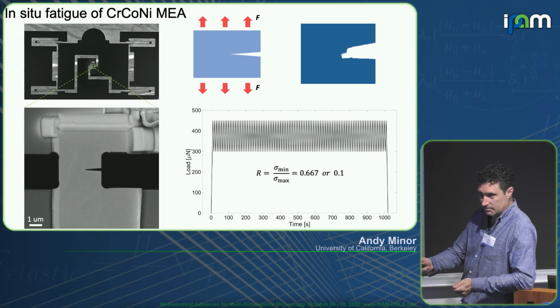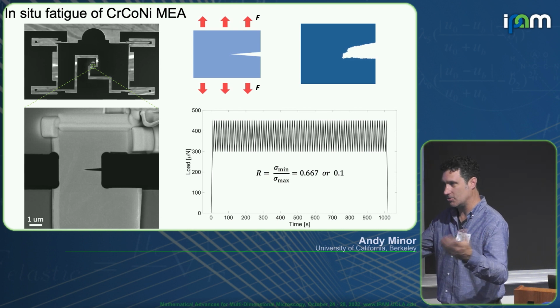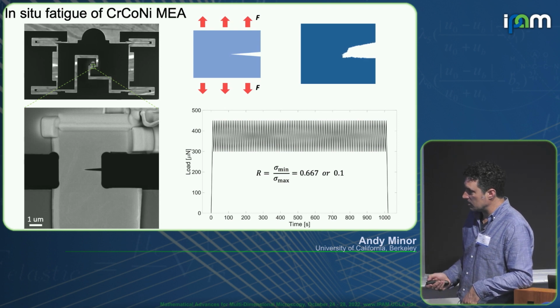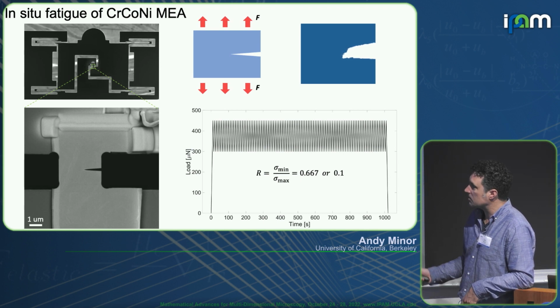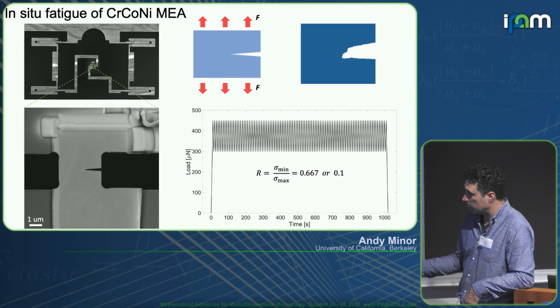tensile tests, if you just take a sample and pull it apart, are kind of chaotic, and you don't really see a lot. Things just break, especially when you get down to these thin dimensions. But fatigue is good because you basically have a stable deformation that you can control. And so the way we do these experiments is to use what's called a push-to-pull tester. So this is a little MEMS type device, or a little microfabricated silicon device. If you push on this knob here, this part of this device is pulled apart. So you can imagine you push here, and it turns the pushing into a pulling. So if you put something across this gap right here, you pull it, and that's what's shown here.